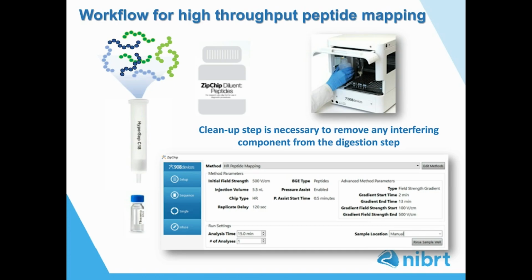In quality control laboratories, the analysis relies on the fingerprint match of the UV traces generated by tryptic digest when they are separated on a reverse phase column. However, this analysis usually requires long sample preparation and overnight enzymatic digestion step, plus long analysis time.